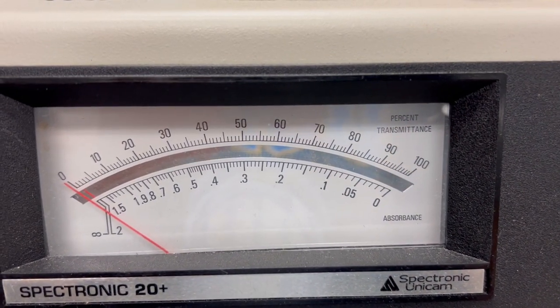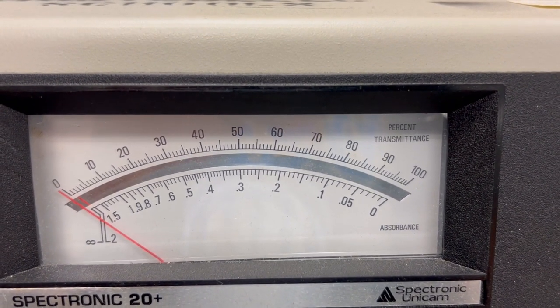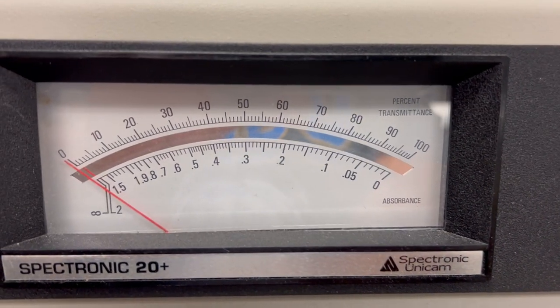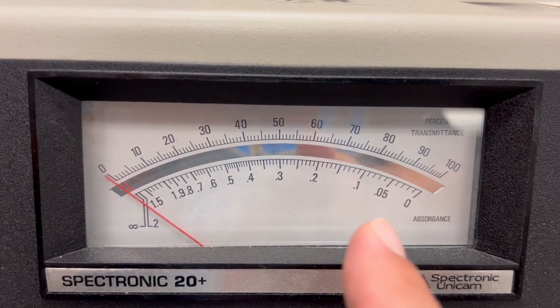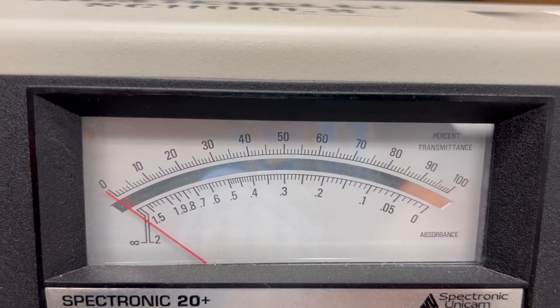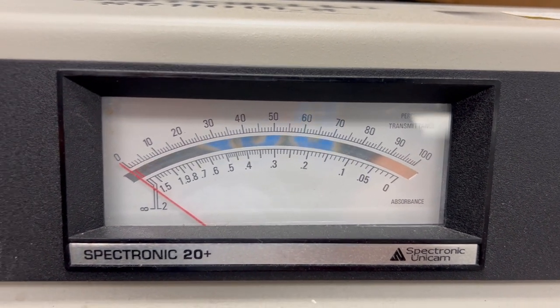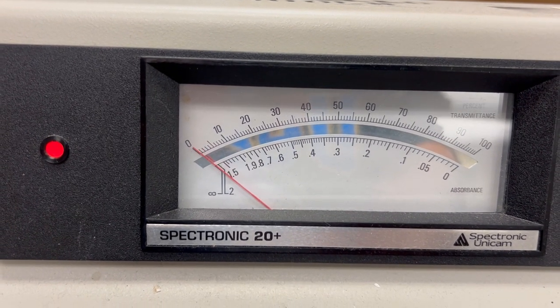This machine has two scales: the top scale is percent transmittance, and the bottom scale is absorbance. It's much easier to read the percent transmittance, so we take our readings on the top scale. The bottom scale has decimals and is not linear, while the top is linear. We will convert percent transmittance to absorbance later.